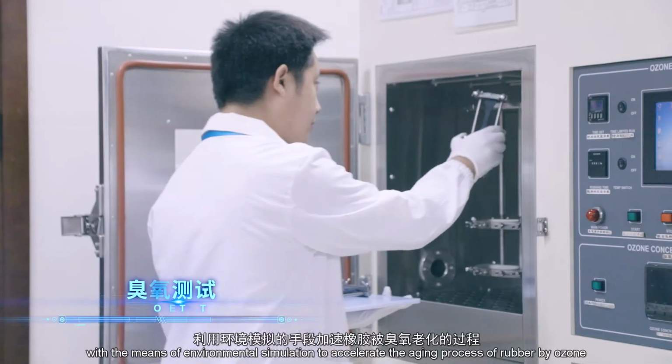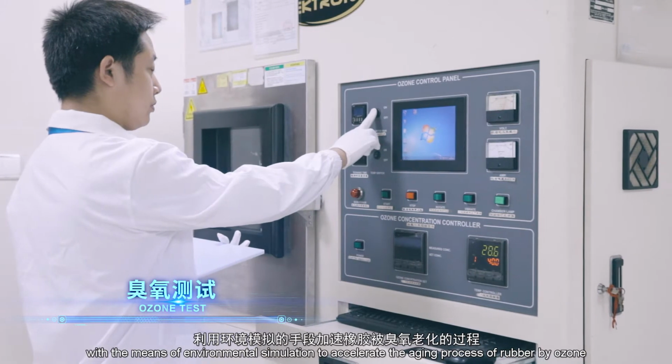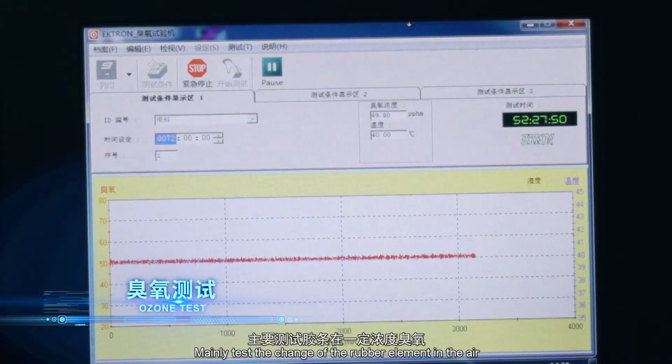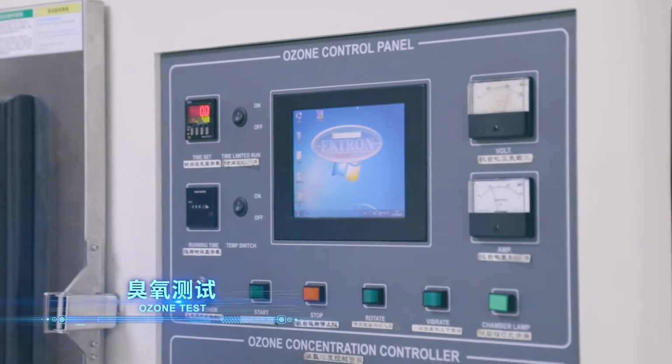Ozone test. With the means of environmental simulation to accelerate the aging process of rubber by ozone, so as to test the aging resistance of rubber products. Mainly test the change of the rubber element in the air and temperature environment with a certain concentration of ozone.